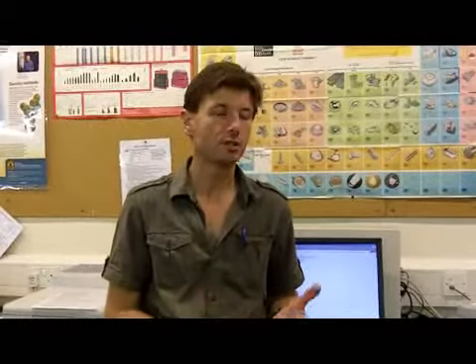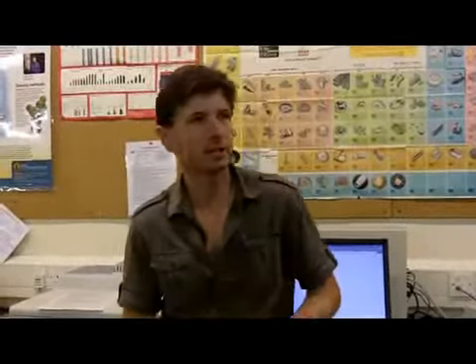That's fine. So what we've done is we've given you two sets of data that was recorded a couple of years ago by PhD students in physical chemistry for an experiment which was published shortly afterwards. Your job is to try to interpret the data and reach whatever conclusions you can, as many conclusions as you can about the data. Now, there are questions in the manual to guide you about the sorts of things you should be answering. There's lots and lots of information there that you might be able to get in addition to that.